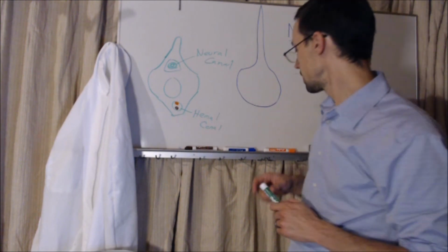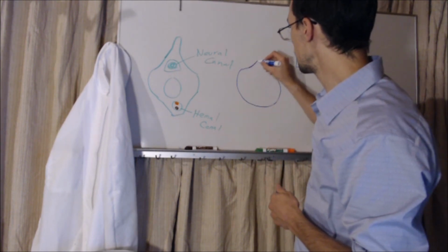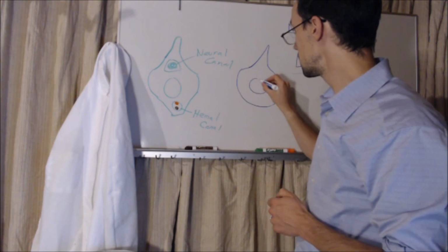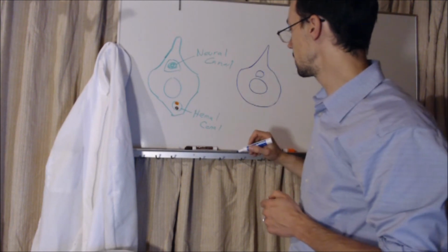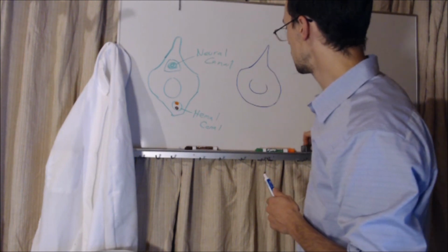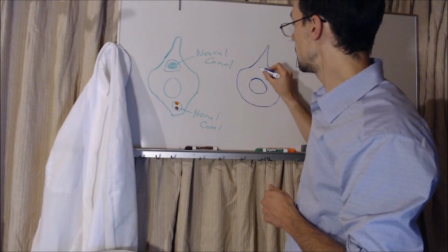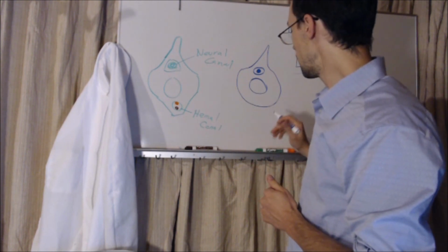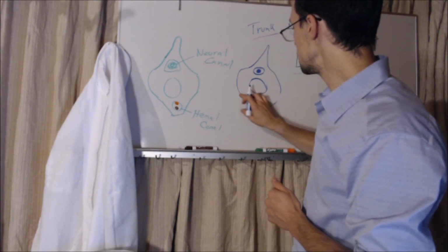In addition, if we go to, in blue here is my trunk vertebrae. Same thing, I have my neural process. I have my spinal cord and my dorsal hollow nerve cord. Wait, what am I doing here? Okay, never mind, sorry. Getting turned around. This was my intervertebral disc. Sorry. Here's my spinal cord running through the neural canal. Okay? One of the things we have here on my trunk vertebrae is an additional process.